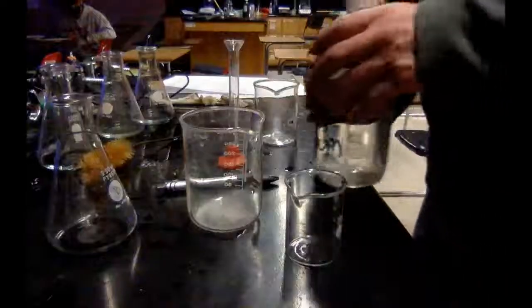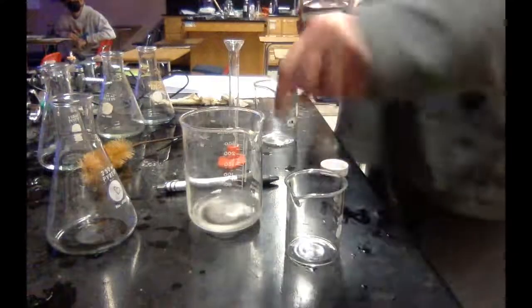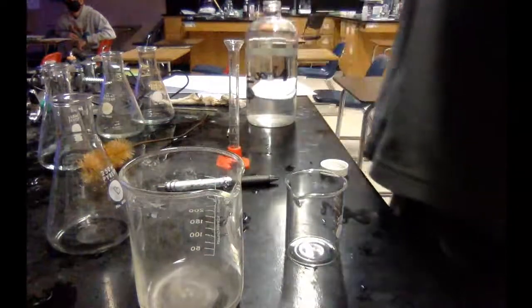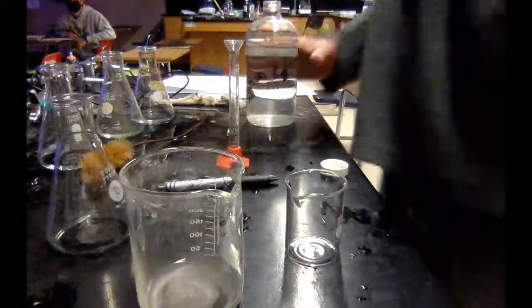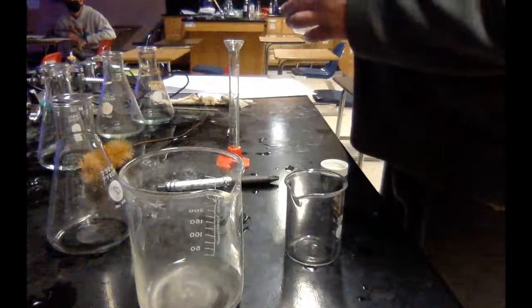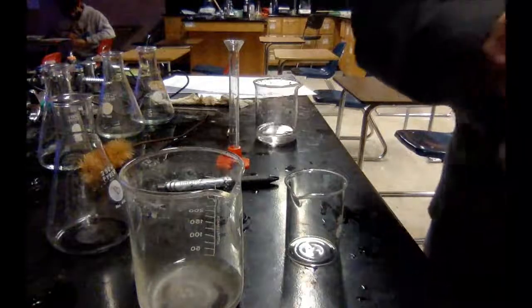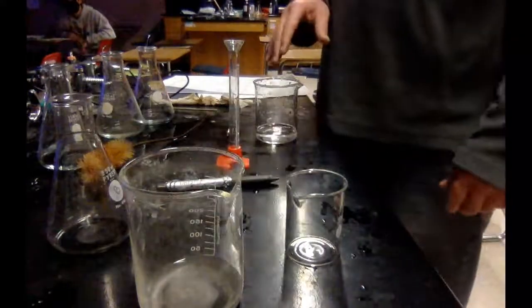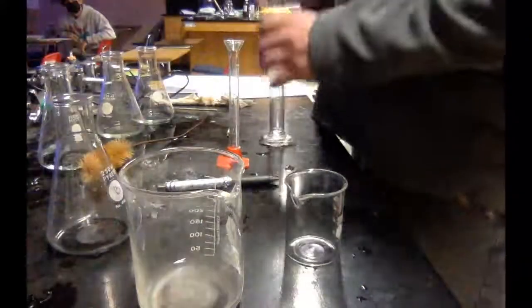So here we have a not cleaned one. I just want to show you that it's possible that if I didn't clean this, the reaction could be taking place at this point. So I'm going to cheat clean this one. We'll see if the reaction takes place there. I'm going to go ahead and take 25 of this. I know that you guys don't have one where you take 25.